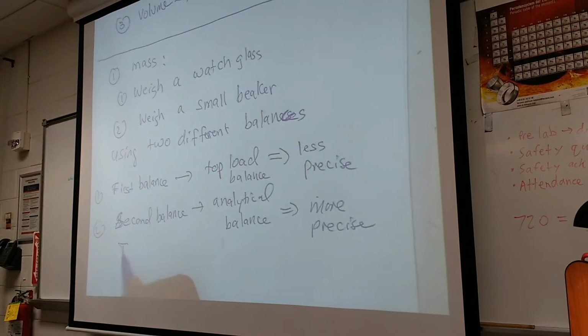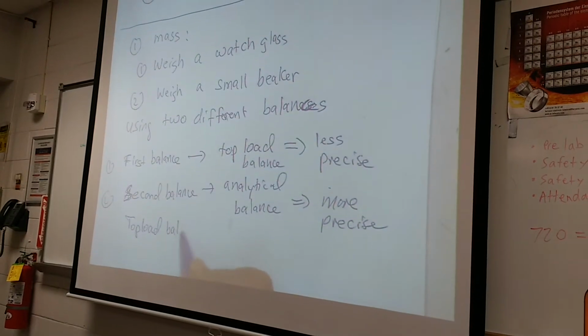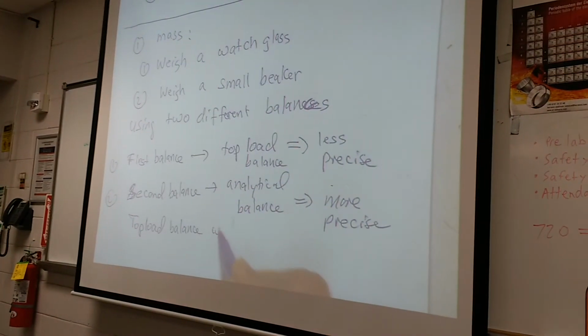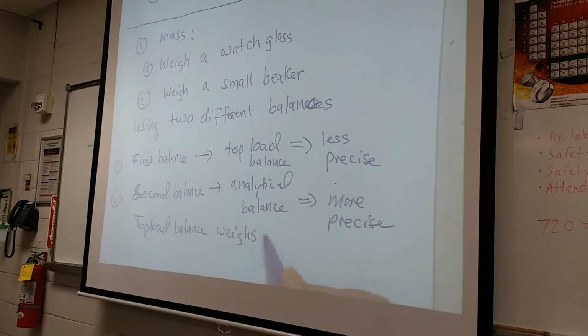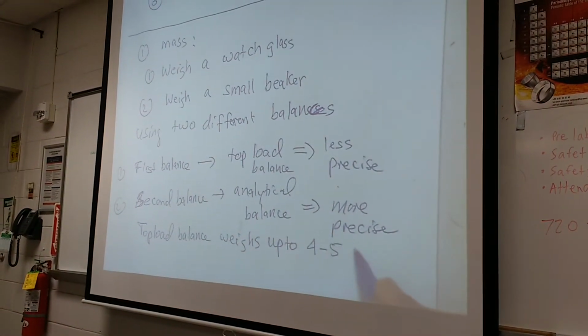So the top load balance weighs up to 4 to 5 digits, correct?